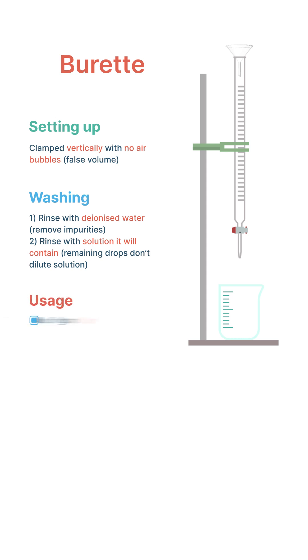When using the burette, all readings should be taken from the bottom of the meniscus at eye level. In filling it, we will use a funnel.